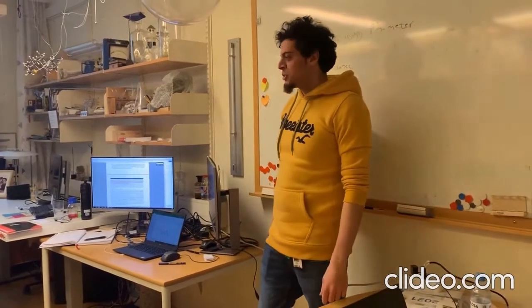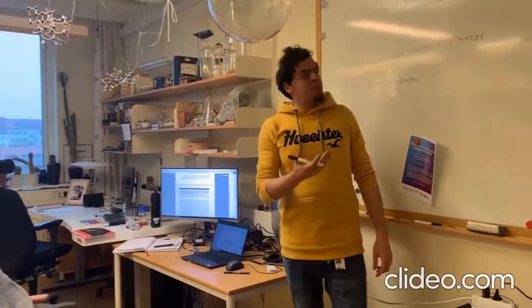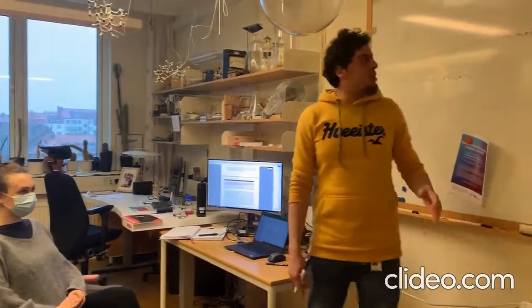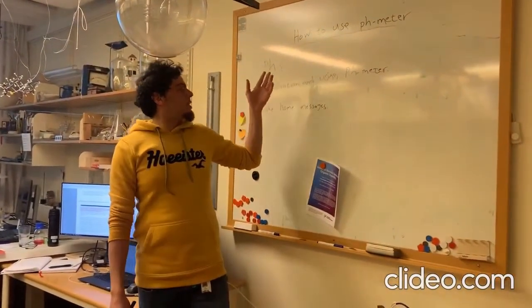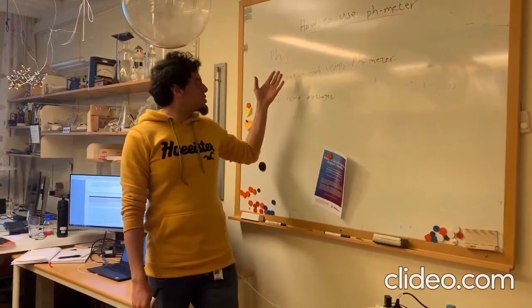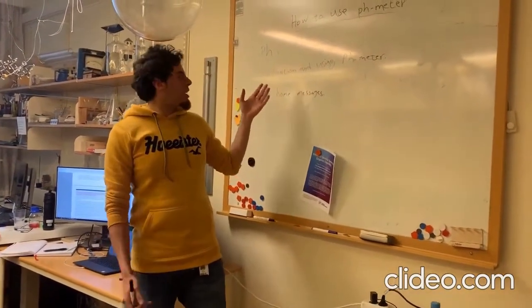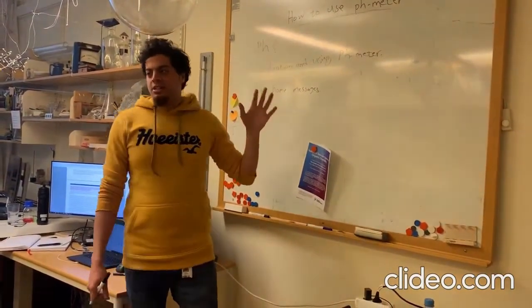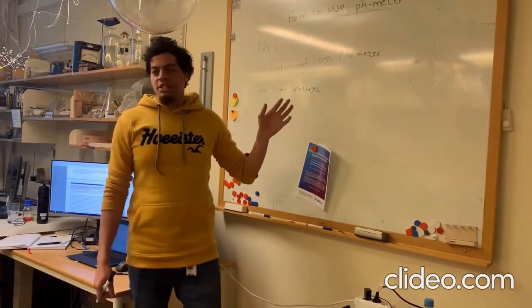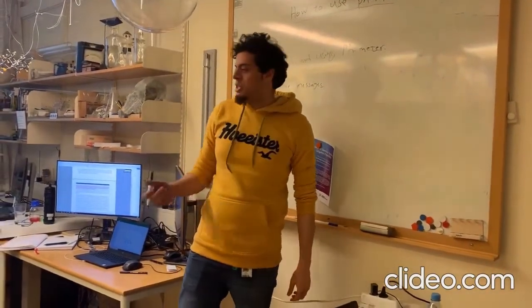So today we are going to explain for you about the pH meter. What is a pH meter in general? I will talk about the pH meter, but before that, I will cover the theory behind pH, what is pH, and then we can go to the lab to see how we can calibrate and use the pH meter. And at the end of this session, I will give you some take-home messages to note down. That is really important when you deal with the pH meter.